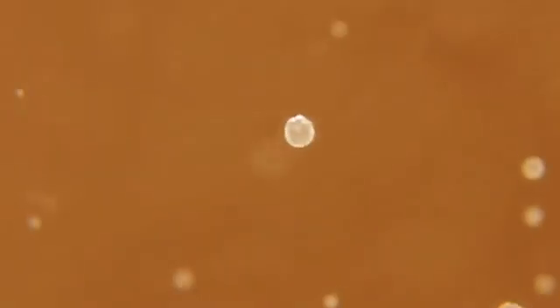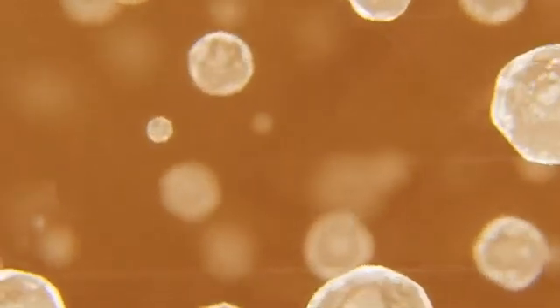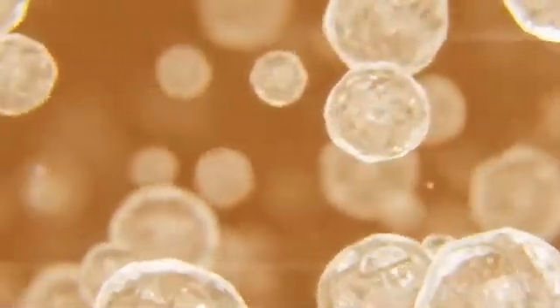Using copper sulfate and ammonium dihydrogen phosphate batch experiments, starting with a clear supercooled liquid and adding ice seeds results in the formation of ice crystals without formation of salt crystals. This is observed in both the copper sulfate and ammonium phosphate experiments. Also, in both systems, starting with a clear supercooled liquid and adding salt seeds results in formation of salt crystals without formation of ice crystals. The presence of either of the two phases, or both at the same time, is easily determined by turning off the stirrer: salt settles, and ice floats.